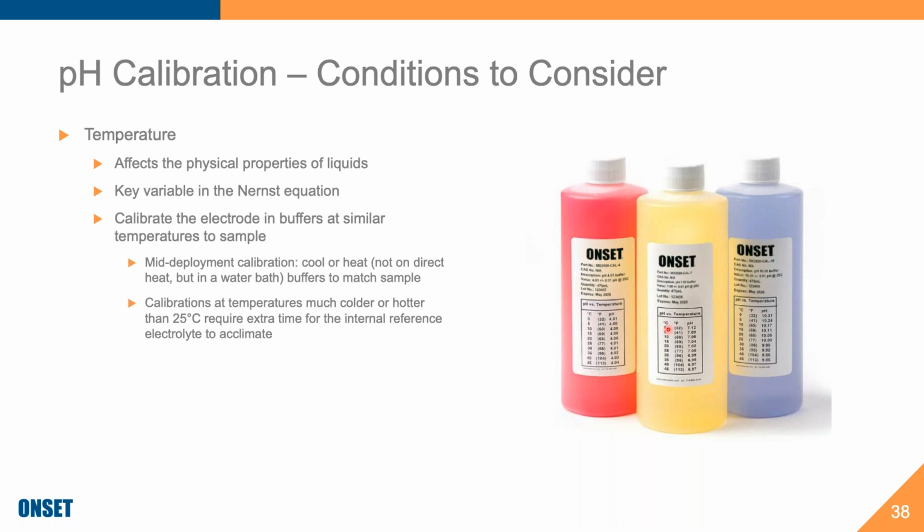Whereas with pH 7, when you see 0 to 45 degrees Celsius, the pH will go from 7.12 through the 7 at 25 degrees and then down to 6.97. So paying attention to what the temperature of your solution is and what the actual pH value should be. This number is usually, and it should be, what's used by the manufacturer to create your slope and your offset. So the answer to the question is definitely pH is important.